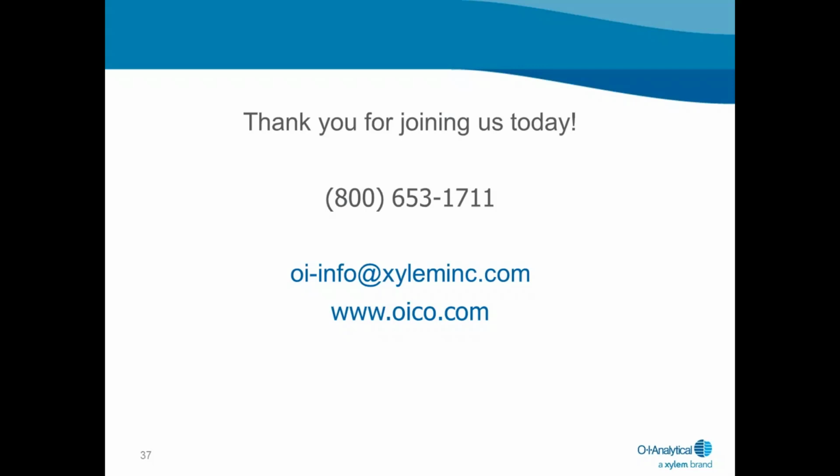Good point. So I think we have time for one more question. What steps would you have to take in order to mitigate the effects of salt with a technique like heated or UV persulfate? Yeah, I kind of touched on that before. And the question in regard to the 400,000 ppm salt-containing sample, dilution is always a consideration.